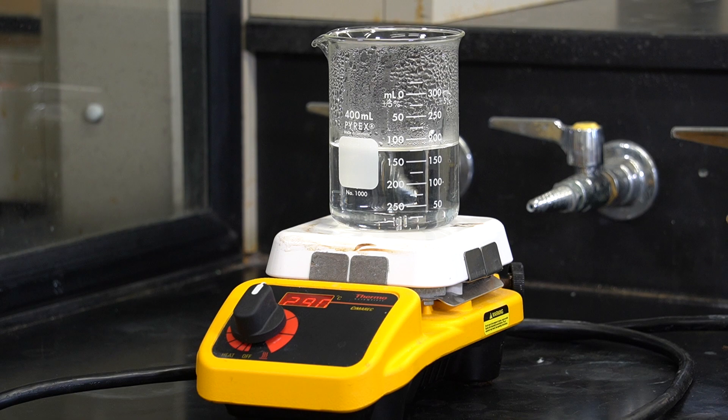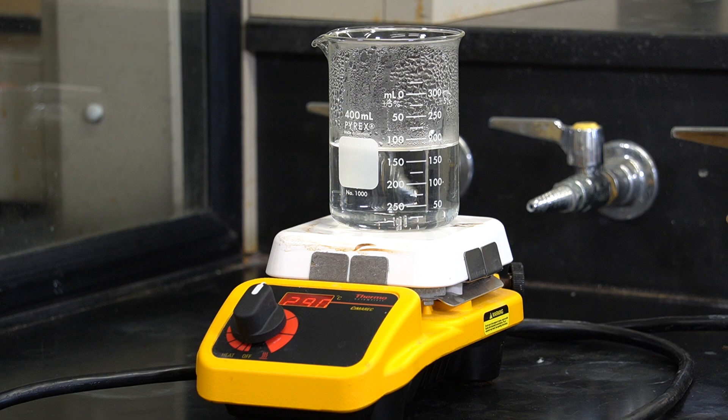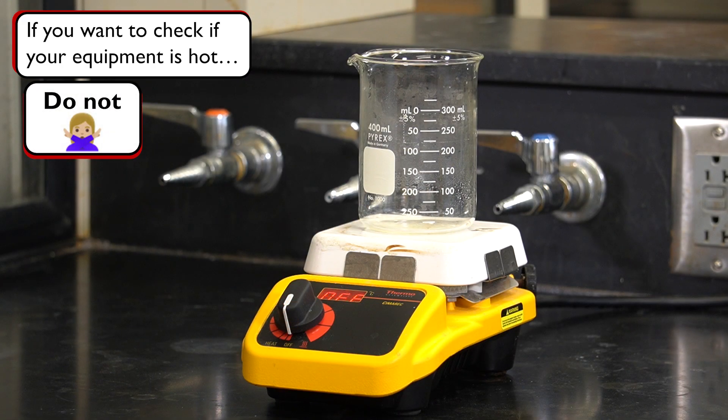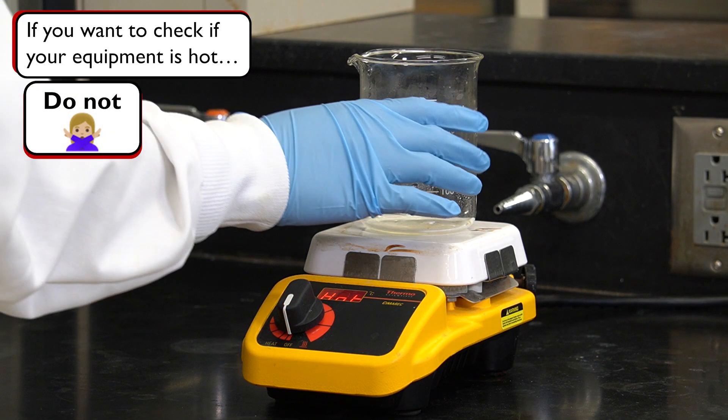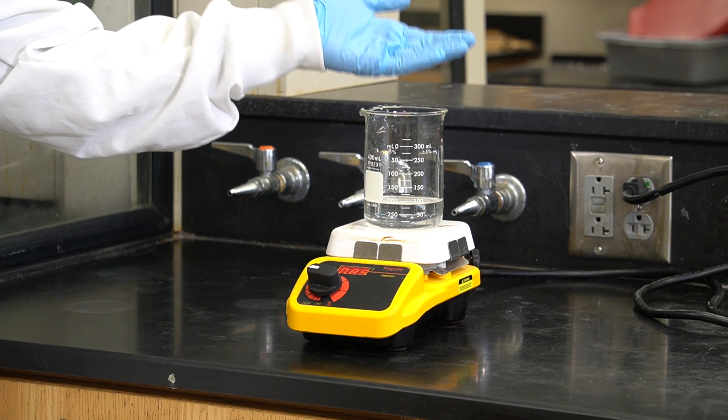The first and most important rule is to never touch hot glassware or equipment with your bare hands. It might sound silly, but it happens all too often. For example, in the lab you might want to check how hot a reaction is, or if a piece of glassware is cool enough to handle. In these situations you might instinctively do a quick touch test — please never do this. Even a brief contact with very hot glassware can cause burns.